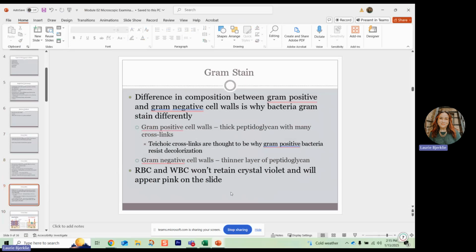And then there are sometimes, depending on the sample you're gram staining, not everything is pure organism culture only. A lot of times we might get a sputum sample, or different swabs from a wound or something like that. There might be blood cultures we're gram staining. So there sometimes are cells that are also stained in the gram stain process. It's not just the bacteria that's sitting there.